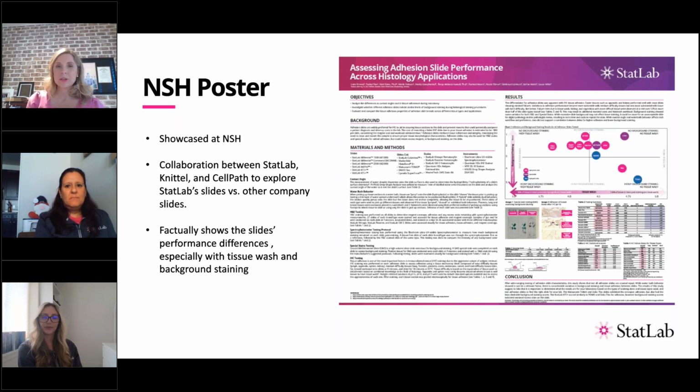We presented this poster earlier this year at NSH. We put it in the attachment here for this webinar, and we'll absolutely send it out to you as well, so you can check out the findings that we have. This paper factually shows how different slides are crafted and how they impact what you're doing in the lab.